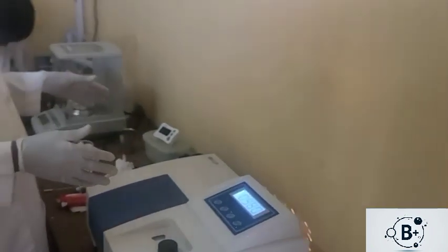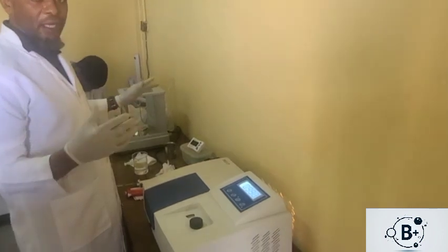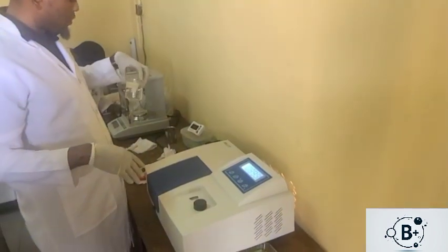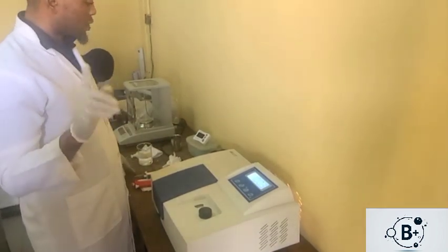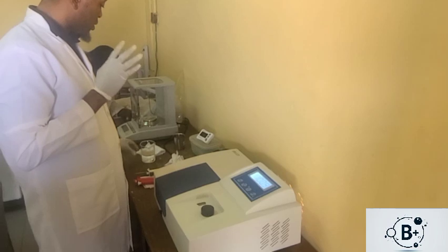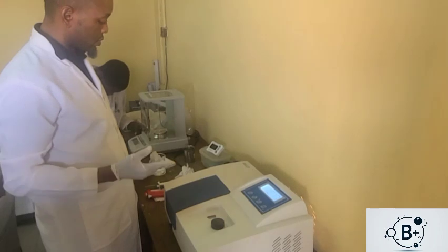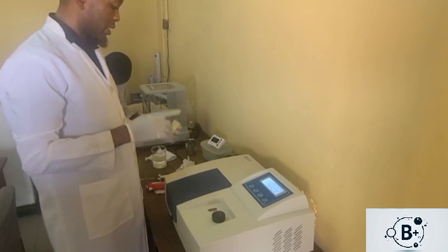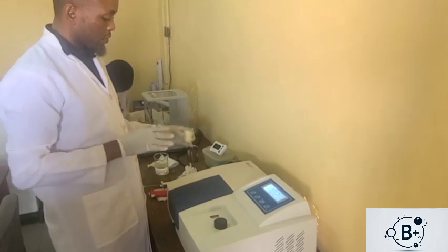So we have to look at the reagent and check, where we are using buffer, if the buffer is actually well calibrated. Like the buffer I'm using, phosphate buffer, which is calibrated at a pH of 6.5. If it's showing otherwise, then we have to look at it very well and adjust it to know whether the issue is from the buffer. Or otherwise, we look at the reduced glutathione and see if our composition is okay.